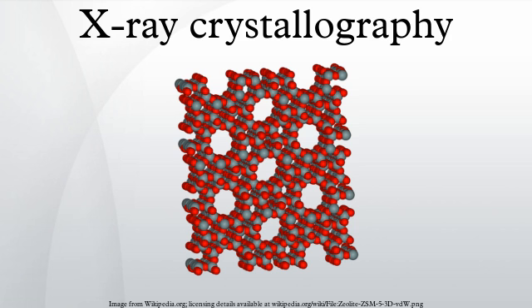In such systems, electrons are boiled off of a cathode and accelerated through a strong electric potential of 50 kV. Having reached a high speed, the electrons collide with a metal plate, emitting Bremsstrahlung and some strong spectral lines corresponding to the excitation of inner shell electrons of the metal. The most common metal used is copper, which can be kept cool easily, due to its high thermal conductivity, and which produces strong K-alpha and K-beta lines. The K-beta line is sometimes suppressed with a thin nickel foil. The simplest and cheapest variety of sealed X-ray tube has a stationary anode and runs with 2 kW of electron beam power. The more expensive variety has a rotating anode type source that runs with 14 kW of e-beam power.